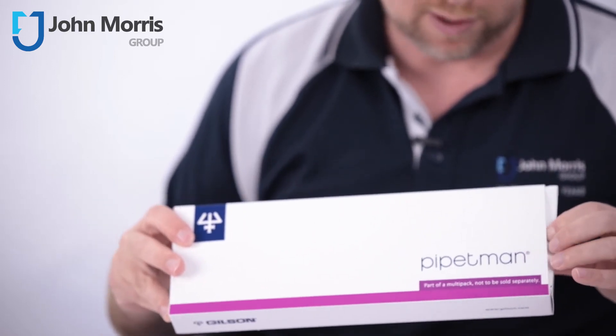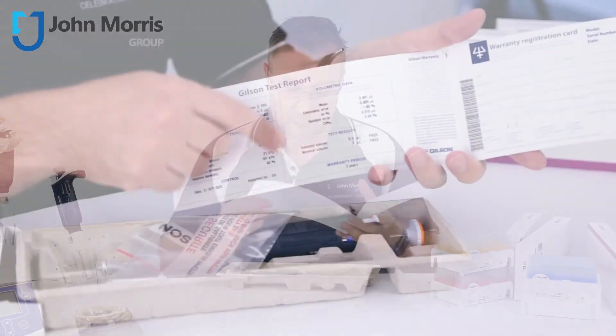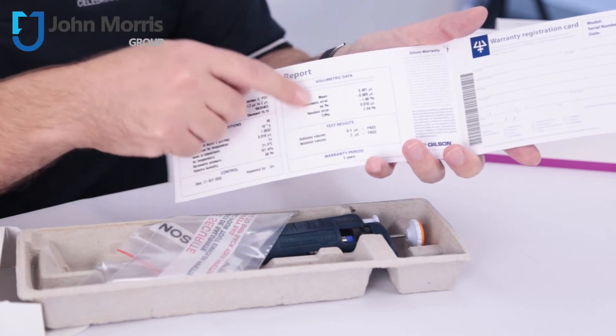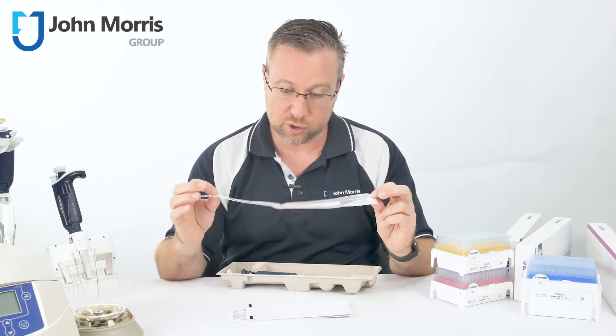So let's open the 200 and see what you get in this box. As per standard, you get your individualized calibration and verification certificate. You also get your return satchel for when you're sending it back to us or to any other laboratory for calibration.